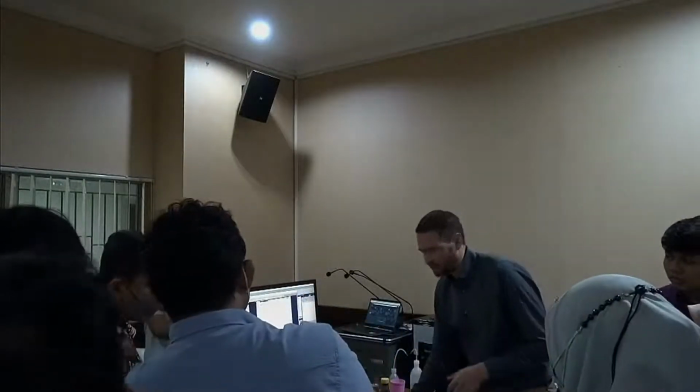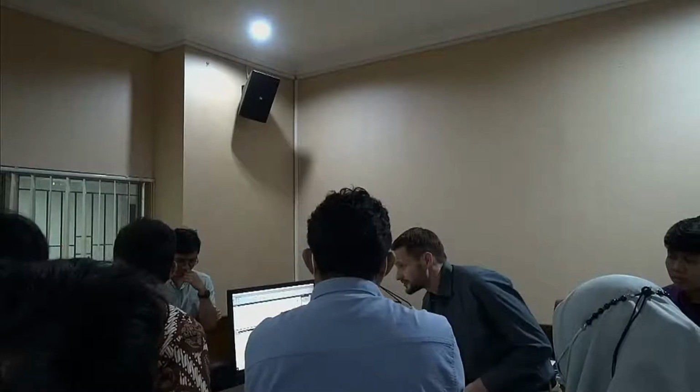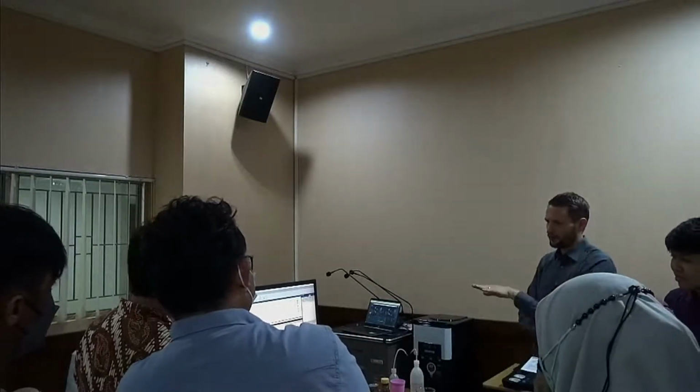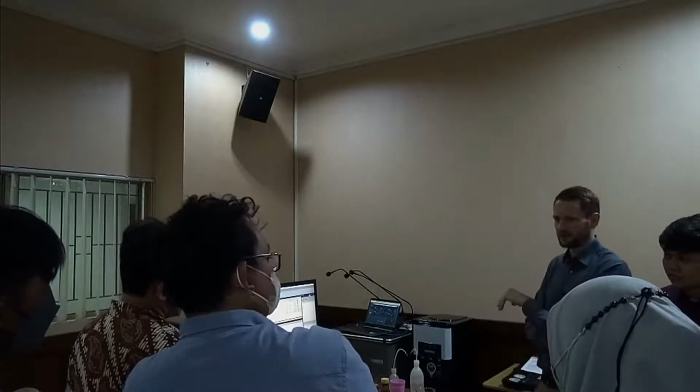Of course, there are many more features in here which I could show you, but which we don't have the time for. Since you're the last group, you're also lucky enough to have 7 minutes more already than the other groups. But I think at that point we close, but we still have time. If there's anything you're interested in, anything you want to see, we'll definitely stay here a little longer.